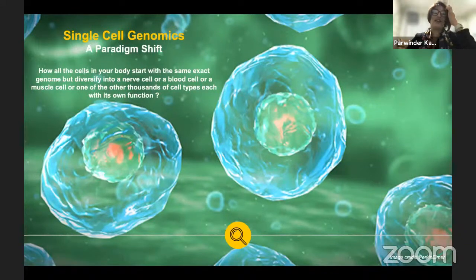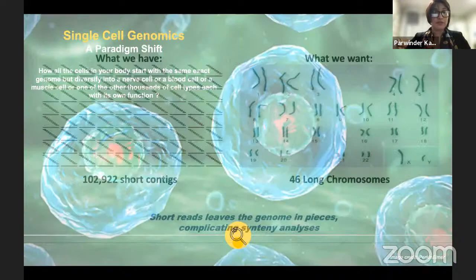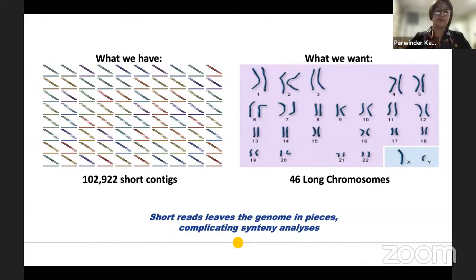So this is the second biological mystery, and it is such an amazing time in terms of the technological advancements we are living in, that we can actually sequence every single cell and every single gene in our body or in any organism. So it's really exciting times with next generation sequencing, but we still have some challenges. Most of the next generation sequencing technologies that we can afford or are reasonably priced are short read technologies, also called Illumina sequencing. What that gives us is lots and lots of pieces of that DNA noodle, which we're trying to put together as one long contiguous sequence to make sense out of it. But it's a massive job. As I said, it's 3.2 billion letters.